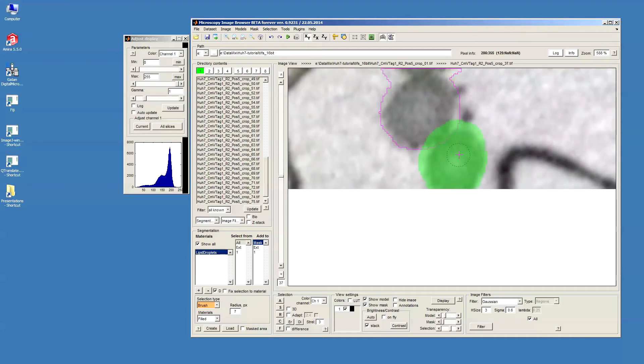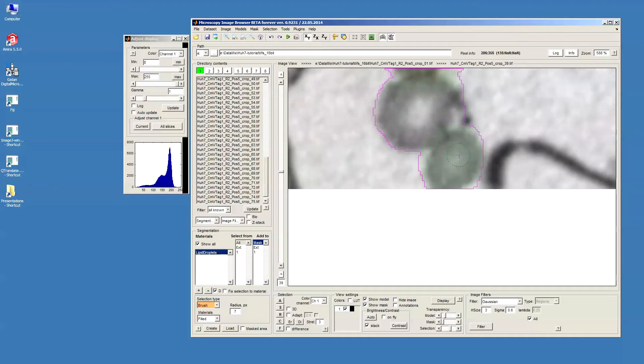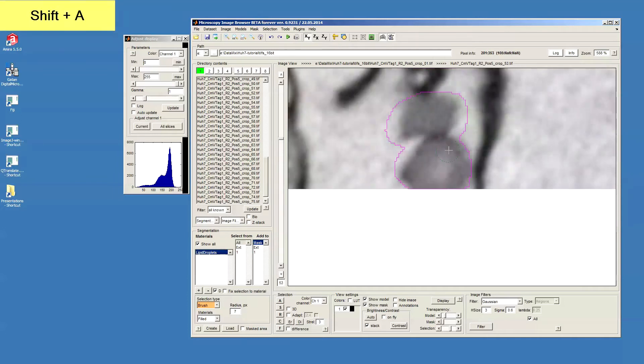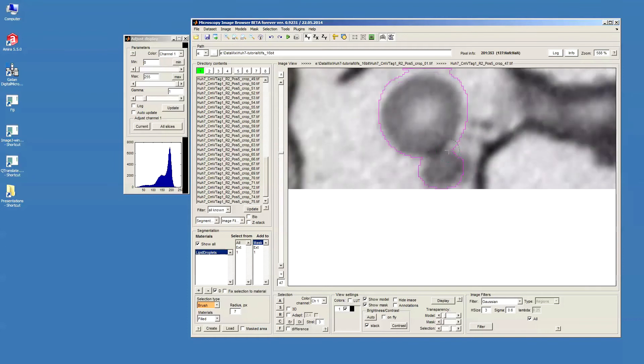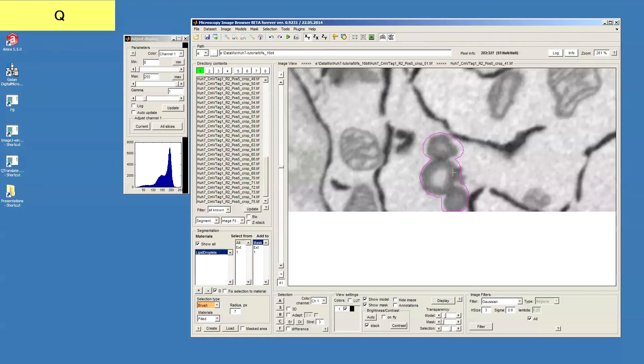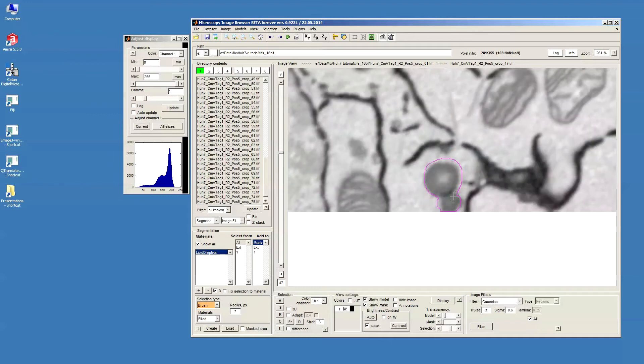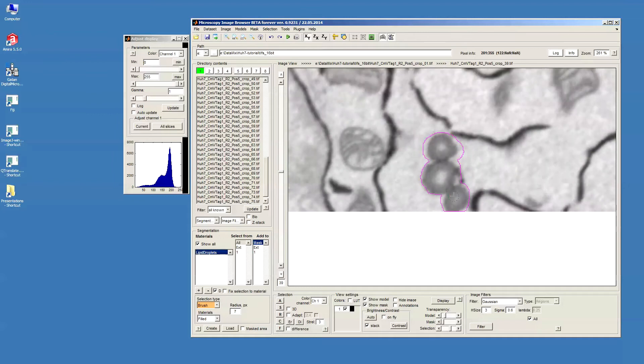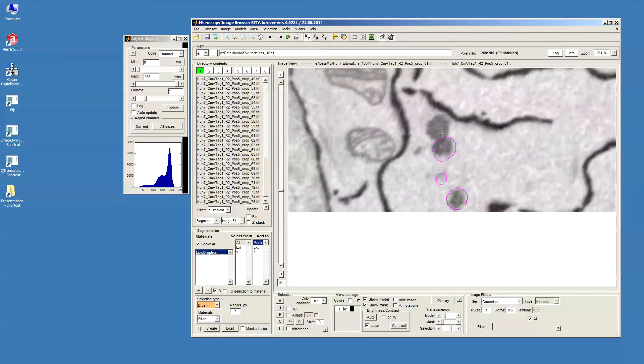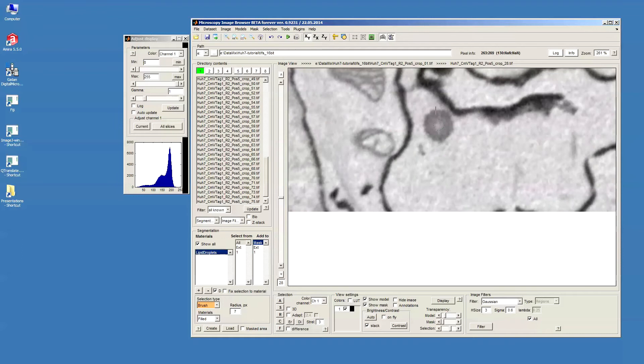In order to do it for all slices I should press Shift+A. And in this case all selection from all slices will be assigned to the mask material. So we continue further with the other lipid droplets.